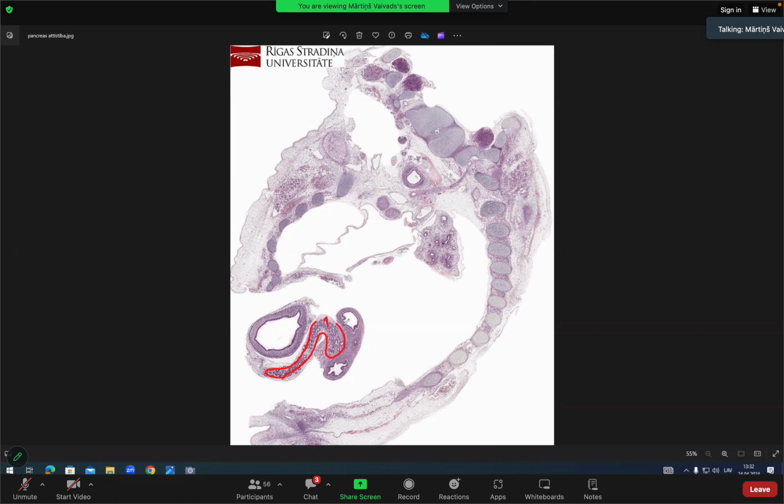What is interesting here, there's also the stomach. So developing stomach and small intestines. So small intestine development as well. SE, small intestine. So one is pancreas development and stomach is developing, ST, stomach development. So stomach is developing here and small intestines are developing next to it.